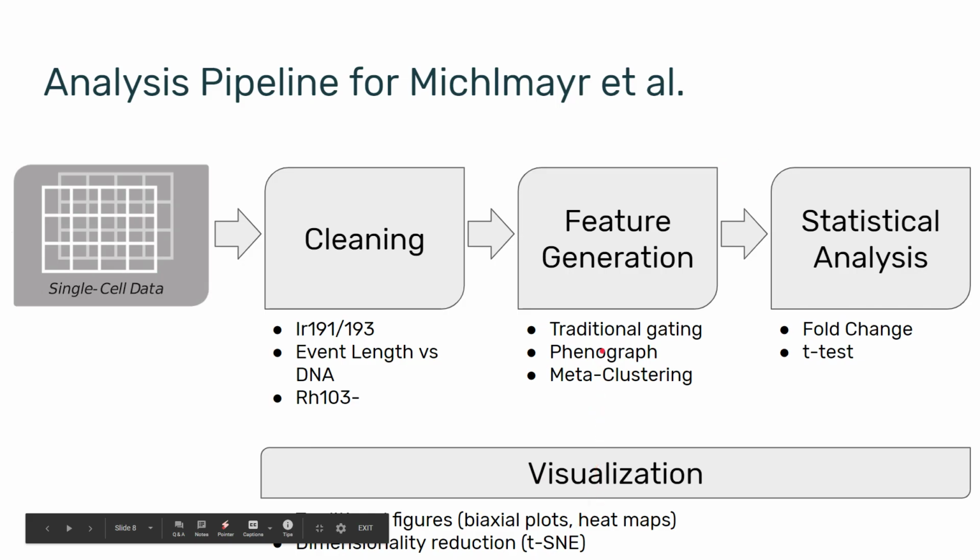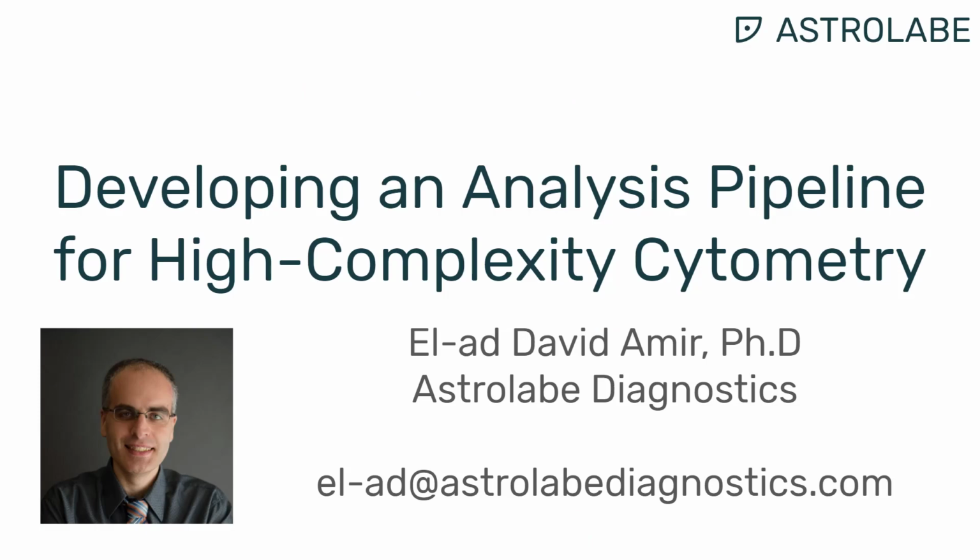So again, this is just one way to build your analysis pipeline, and there are many such papers right now, several such manuscripts available that either talk just about the pipeline, such as Nowicka et al. at F1000, or papers with more biological meaning that include these elements in their methods section. So I hope this makes sense. Feel free to reach out if you have any questions.